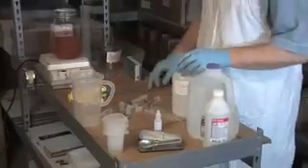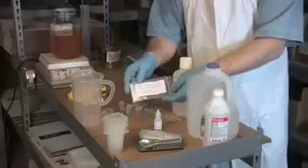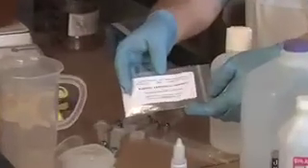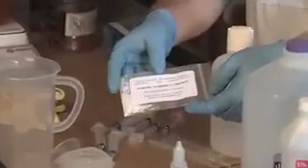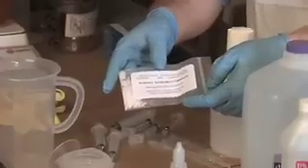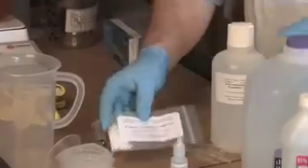You're also going to need some catalyst. In particular, this is potassium hydroxide. Whatever you plan on making your biodiesel with, be it sodium hydroxide or potassium hydroxide, that needs to be the same chemical that you're going to use when you make up your titration solution. You can do the math to do the conversions, but you get much more reliable titrations if you use the same chemical. And that's basically what makes up a basic titration kit.